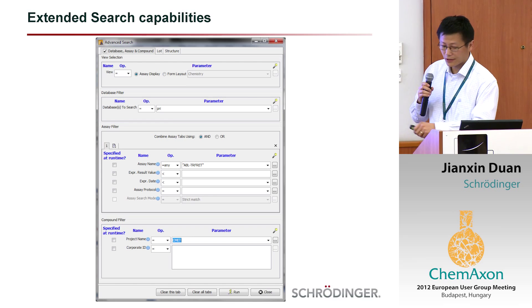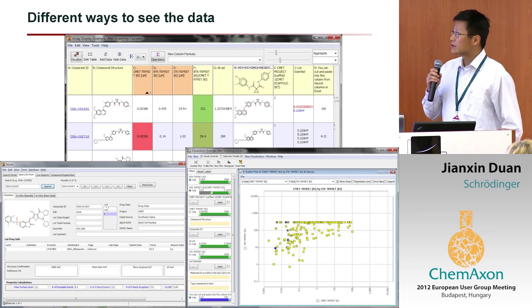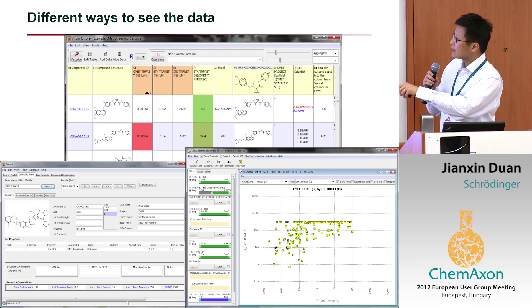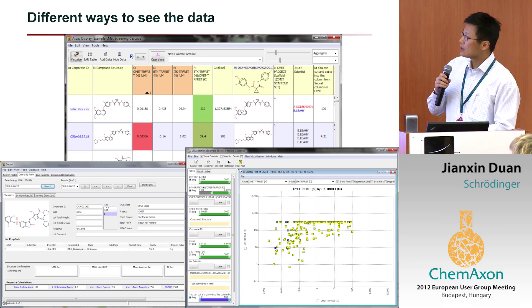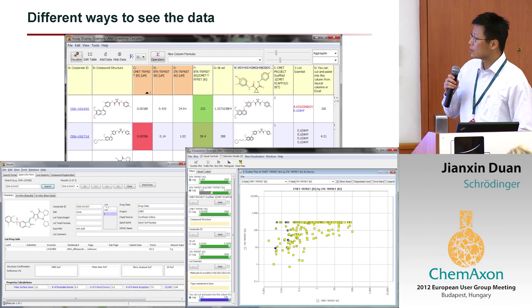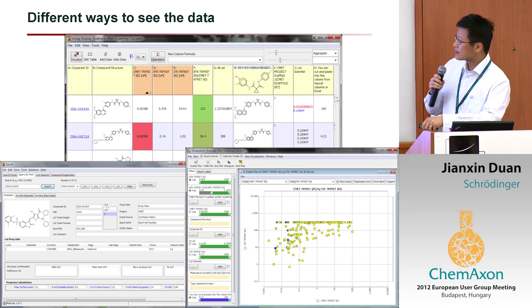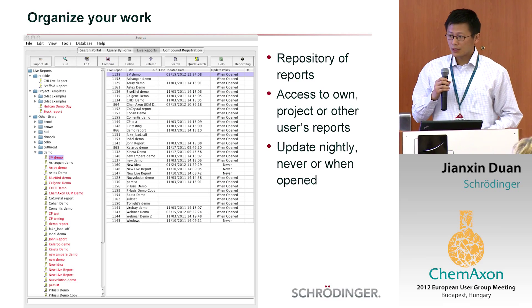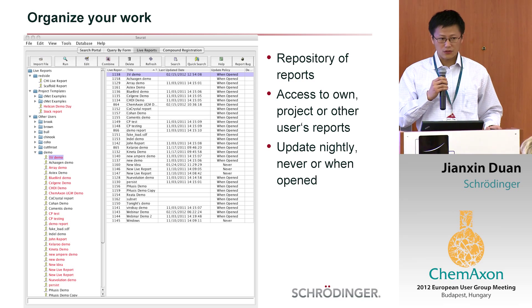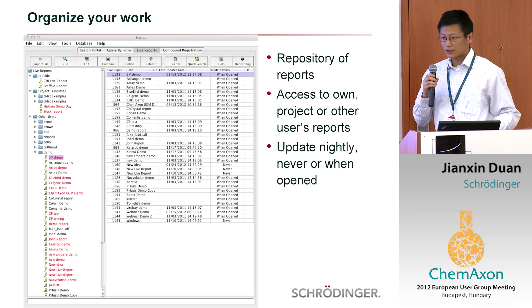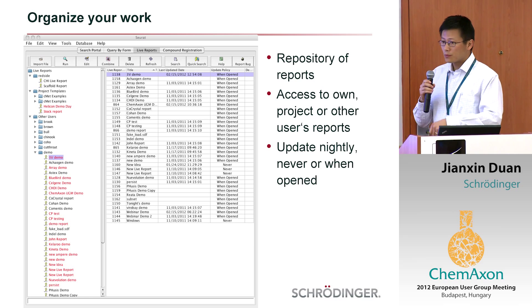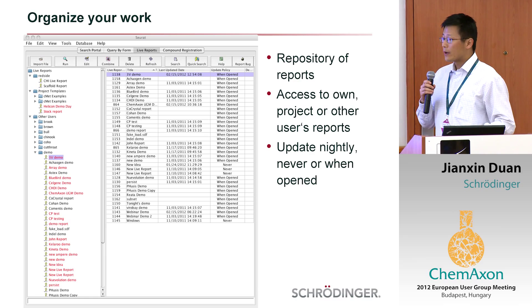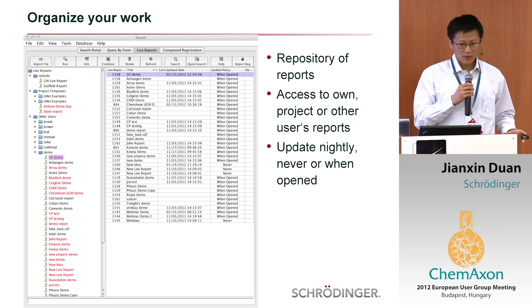There are also compound filters. Once you've done the search, there are different ways to visualize the data. One way is essentially the spreadsheet where you have the compounds and their properties including activities — you can color the cells and rank or sort in different orders. You can also visualize in form format or using different plots: scatter plots, box plots, et cetera. You can organize your work — for example, you can save searches and have a repository of different reports. You can access your own projects, your own reports, or your colleagues' reports, and these reports can be updated every night, whenever you open them, or at the time you generate them.